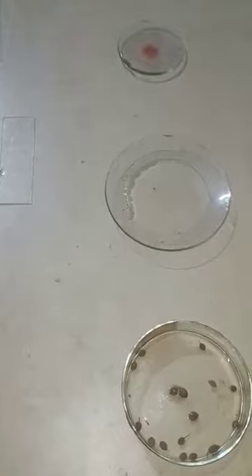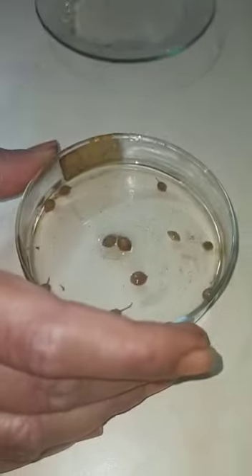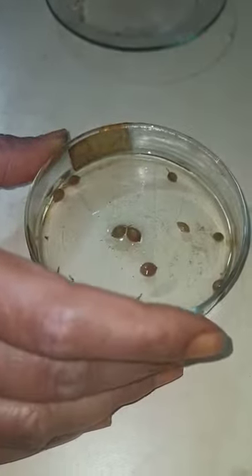Today we are going to prepare a slide of coriander. These are coriander seeds which we have soaked overnight in water, or we can boil them for half an hour in water. This is plain water and this is the staining solution.